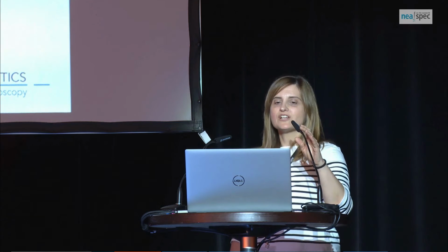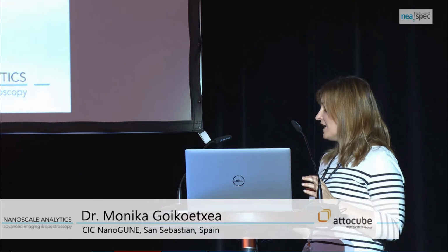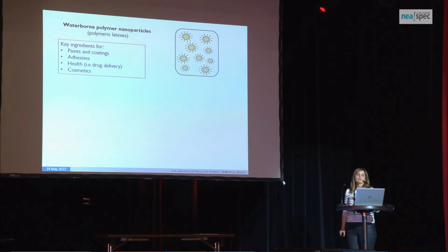I will talk about cross-sectional chemical nanoimaging of composite polymer nanoparticles by infrared nanospectroscopy. First, let me introduce the motivation of this work. Polymer latexes are polymer nanoparticles dispersed in water and stabilized by surfactants, right?